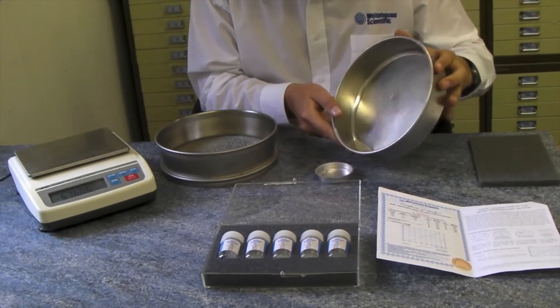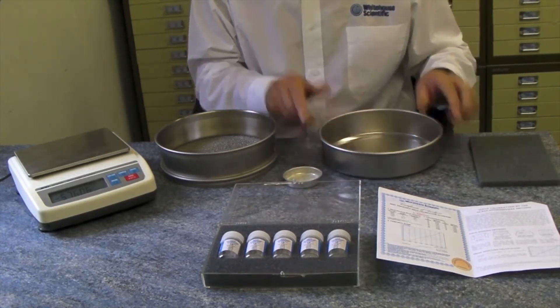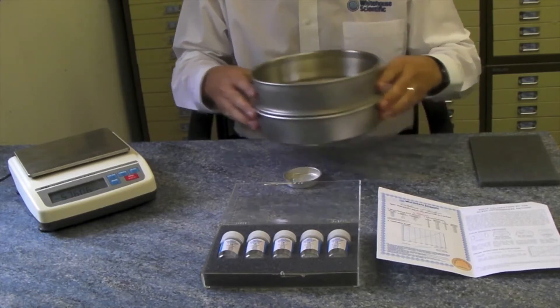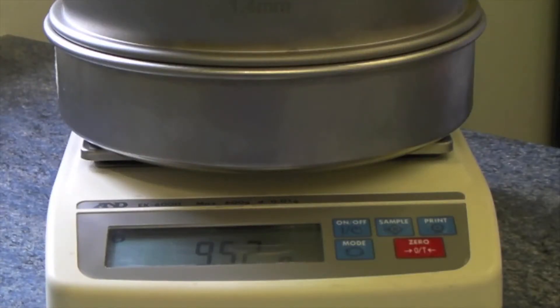For sieves one millimeter or larger, the microspheres can be returned to the bottle and the standard used again, provided no more than 3% of the original weight has been lost. Reweigh and record the retained weight of the standard. Subtract this value from the initial weight to give the weight passing, and convert to a percentage.